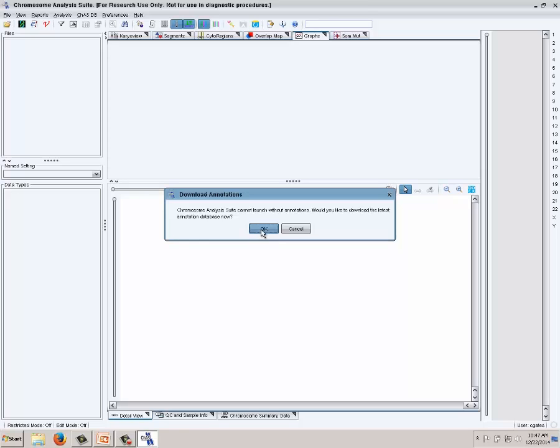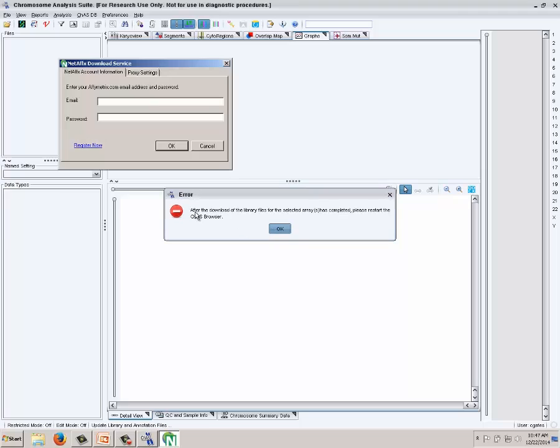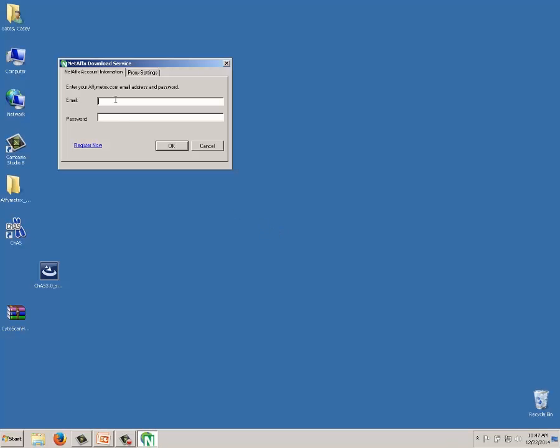I say yes. There's a warning — not an error — that CHAS will need to restart after downloading library files so the browser can recognize them. That's fine. I enter my email address registered on Affymetrix.com to download library files. If you don't have an account, click Register Now to create one free of charge on Affymetrix.com. Clicking OK, the software goes out to the NetFX site to see which array types are available for library file download.